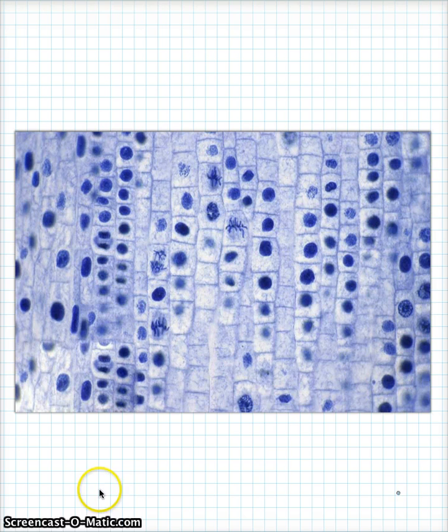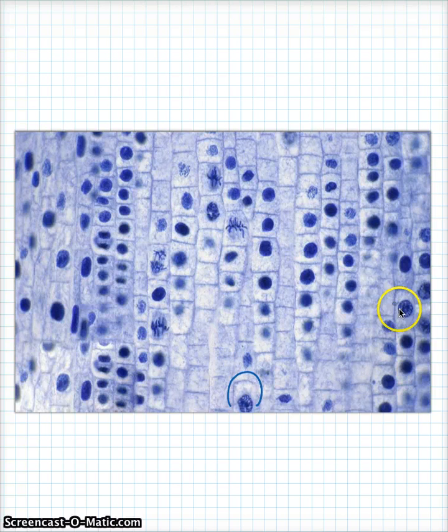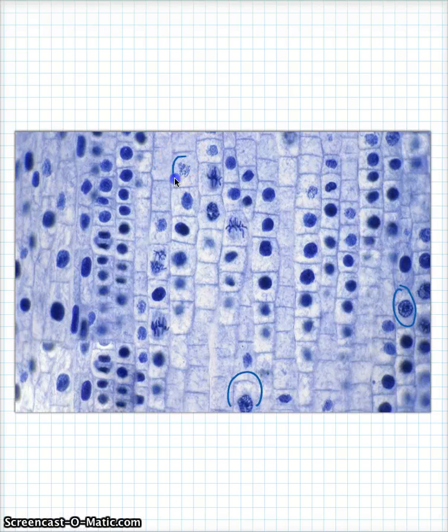More plant cells. Okay, you right now. Point to one in prophase. See if you find one. Did you find this one? Or maybe? Yeah, this one, I don't know. Maybe. Maybe this guy. Barely. Hmm, maybe this one. A little bit tricky. Hard to tell.